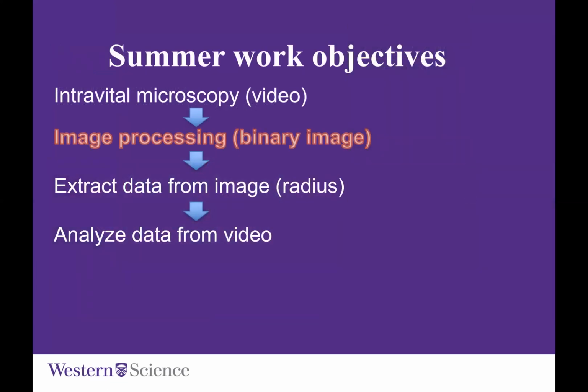To extract data from video, firstly, we need intravital microscopy to record a video. Then we do image processing to get a binary image. Once we have the binary image, we can extract data from the image, for example, the radius of vessel, and analyze the data from the video.